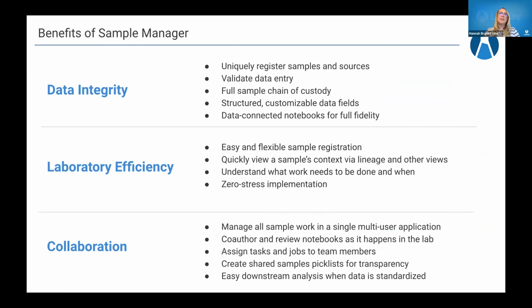So some of the benefits of Sample Manager, and really all of the tiers that I just reviewed, are data integrity, ensuring that anytime you put data into the system, you can validate that data, you can ensure that it's going to be correct coming in for easier downstream analysis later.